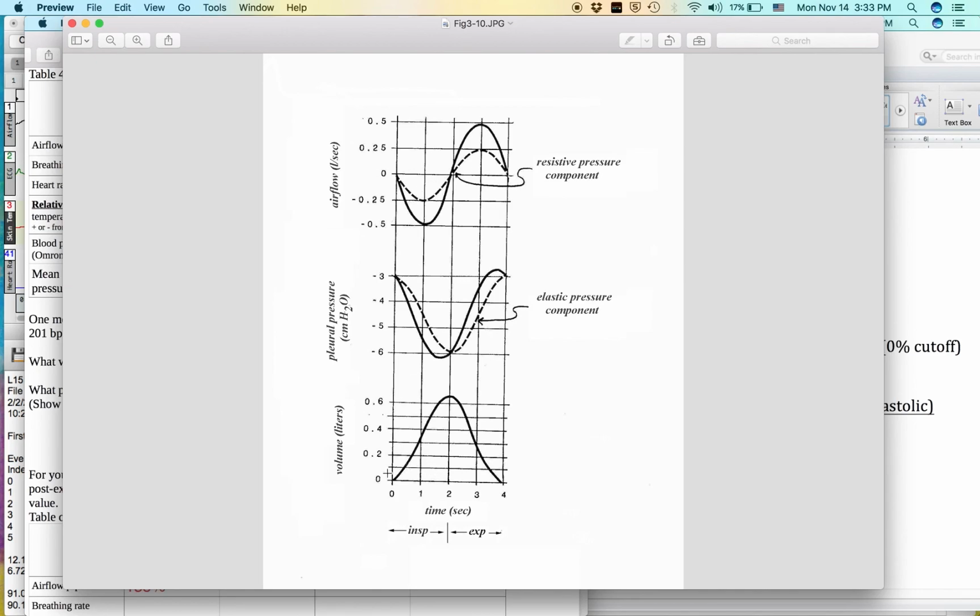So that's why we have one wave for one breath here, but we have 2 waves, if you want to call it that, regarding our flow compared to our liters. So again, as we inhale, the flow starts from 0, goes down, and then approaches 0 again, and then as we begin the exhale, the rate increases and then approaches 0 again as we begin another inhale.